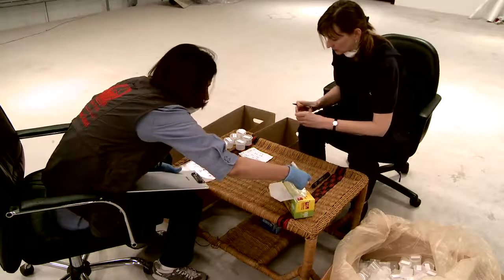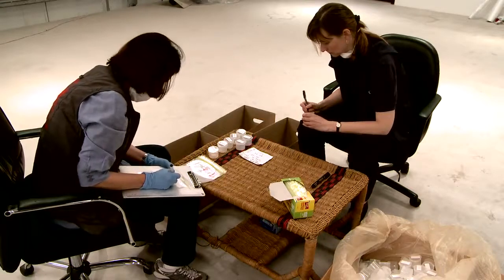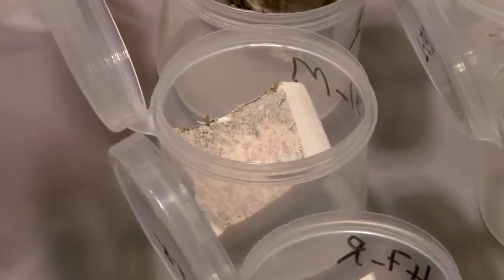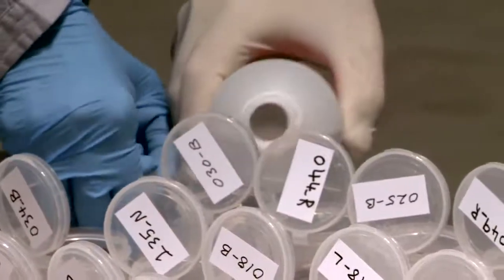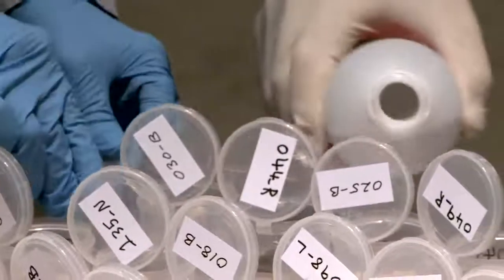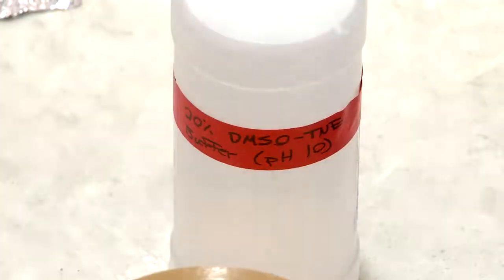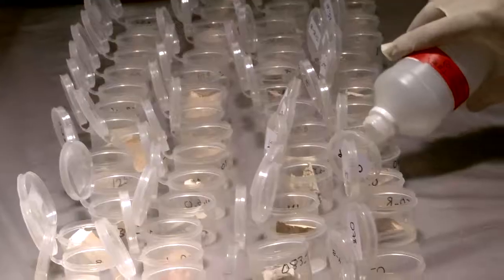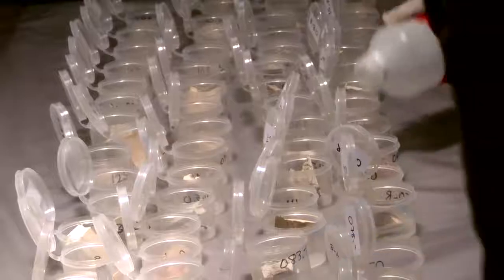If the samples need to be sent abroad for laboratory analysis, the requirements of different countries should be considered and clarified with the laboratory performing the analysis. Some countries require the ivory samples to have been submerged in a decontaminating solution that kills any bacteria on the surface of the tusk. For example, samples to be sent to the United States of America must be soaked in a pH 10 solution for 2 hours to be permitted into the country. If a decontaminating solution is required, the laboratory performing the analysis should provide the solution.